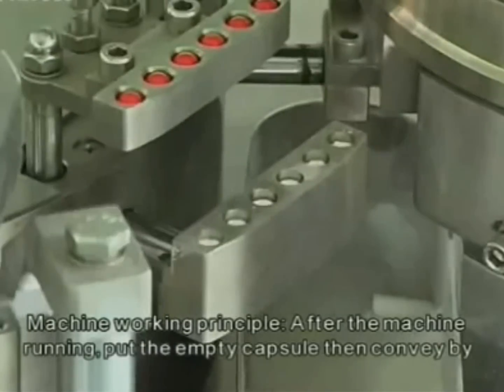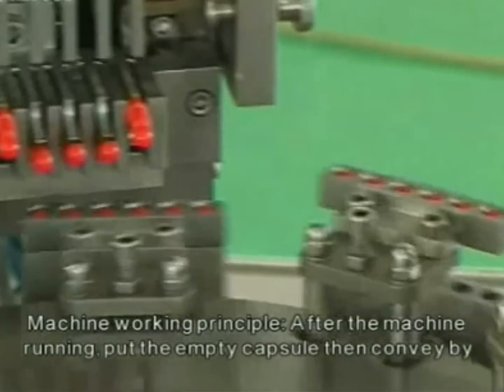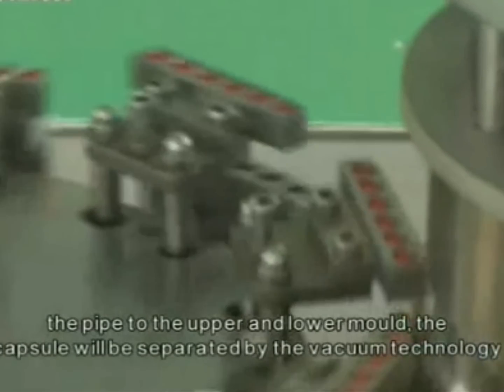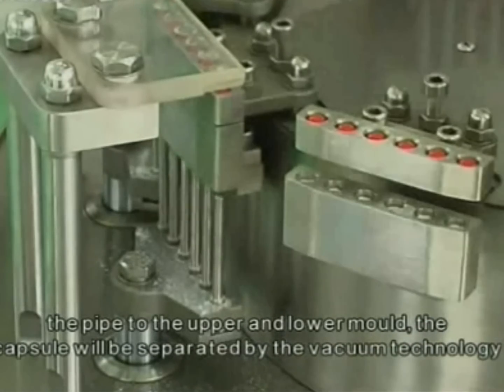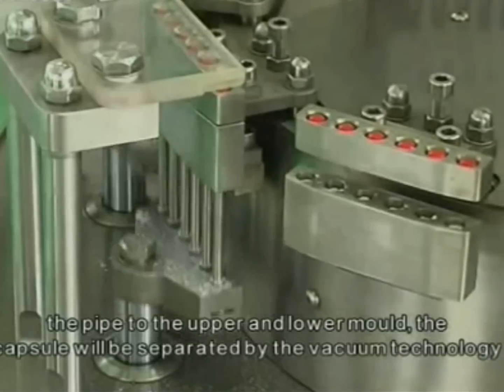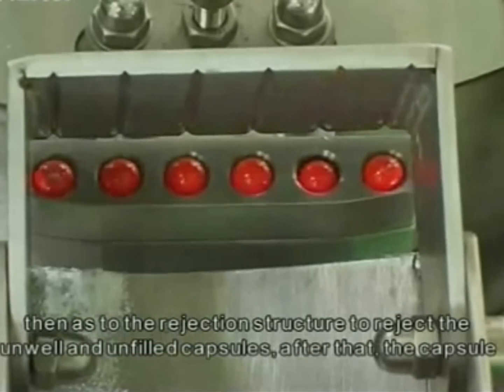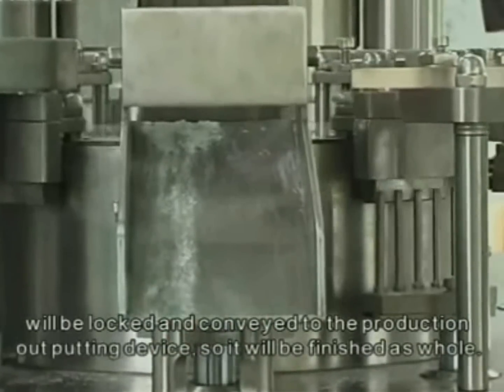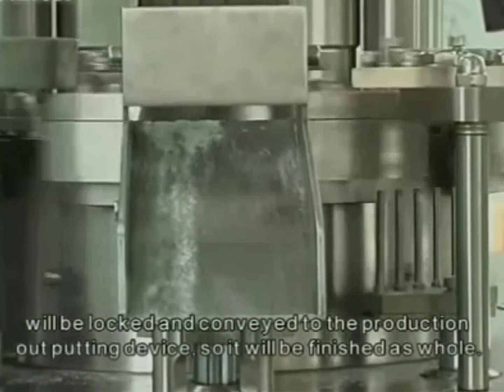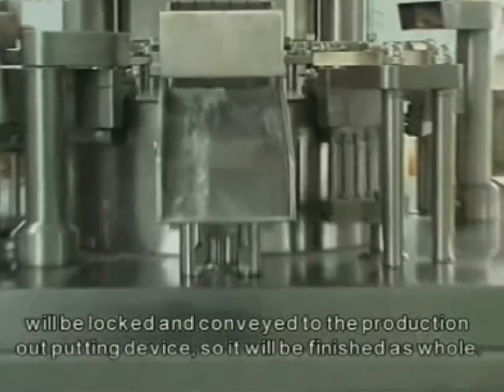Machine working principle: after the machine is running, put in the empty capsules, then convey them by pipe to the upper and lower mold. The capsules will be separated by vacuum technology, then move to the rejection structure to reject unwilled and unfilled capsules. After that, the capsule will be locked and conveyed to the product outputting device.